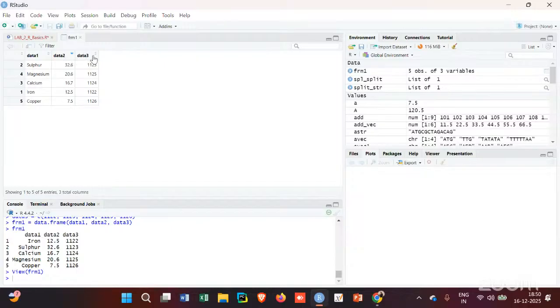Here, based on ascending, descending, or whatever I want, etc. I can perform filtering based on something here or whatever. So this becomes very handy when we are actually dealing with real life data. I will show it to you guys when we actually perform the analysis. So again, these are data frames. This is how a data frame is.